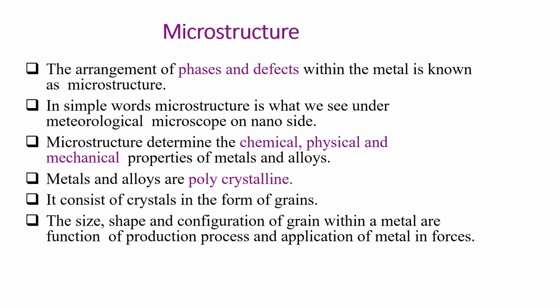Now what do you mean by microstructure? We should know what is meant by microstructure. Is that clear that we are going to study the microstructure, and the process of studying the microstructure is known as metallography? But what is meant by microstructure is also something we should understand.